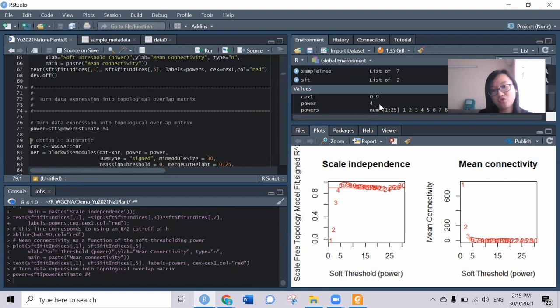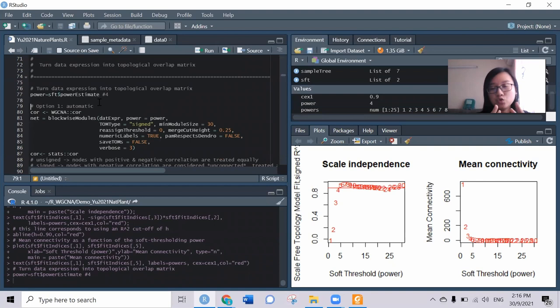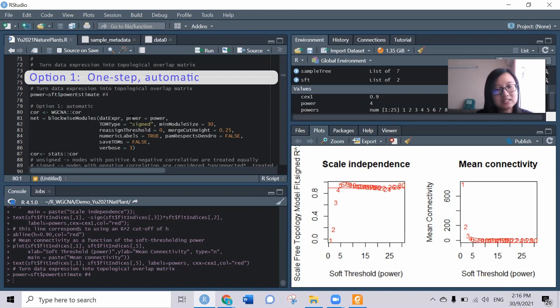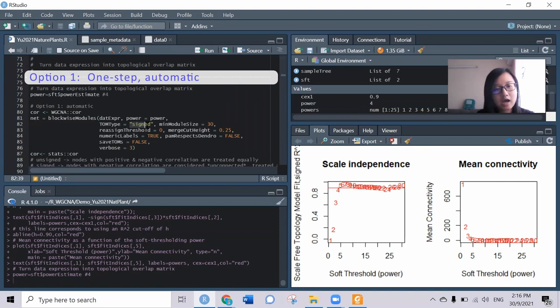Now we come to network construction. This will run through a few algorithms which will help us assign modules based on the dissimilarity of the genes. We have two options. The first is automatic one-step option. This means we'll assign whatever things we need in the function here - we've got the power and minimum module size for each module, which means at least 30 genes should be present in one module. We have to decide the cut height, which means modules lower than 0.25 would merge together into the same module. We also tell them the network type, whether you want signed or unsigned.